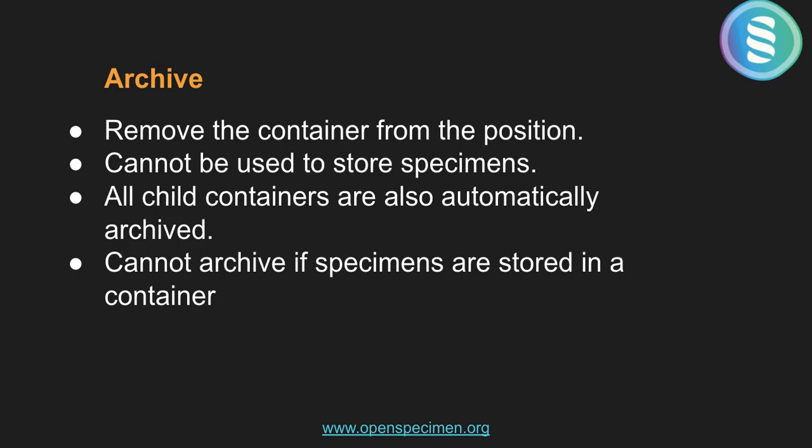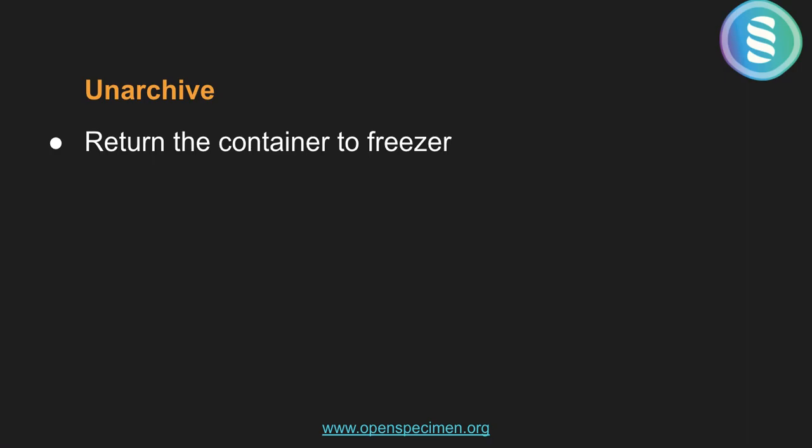So this is archive, and the good thing about archive versus delete is you have an option to undo wrongly deleted containers. That is called unarchive. That means you are going to return the containers to the freezer. Now let's see how it looks in the system.